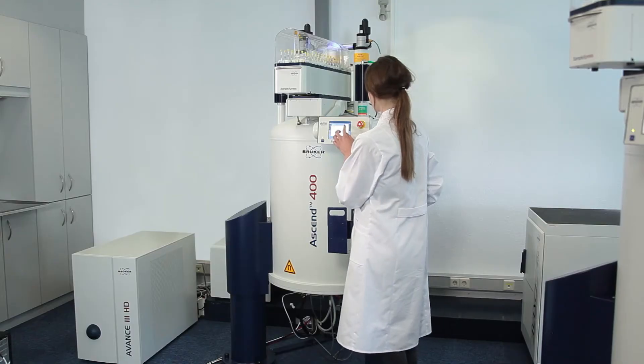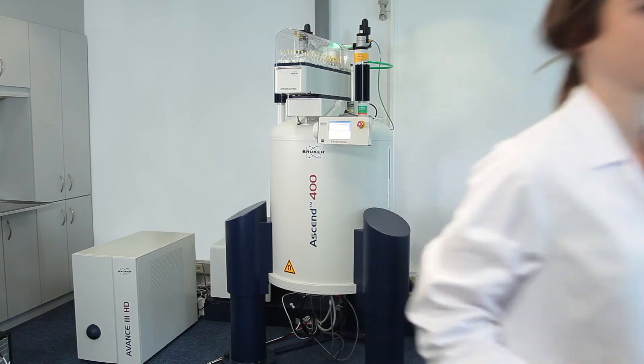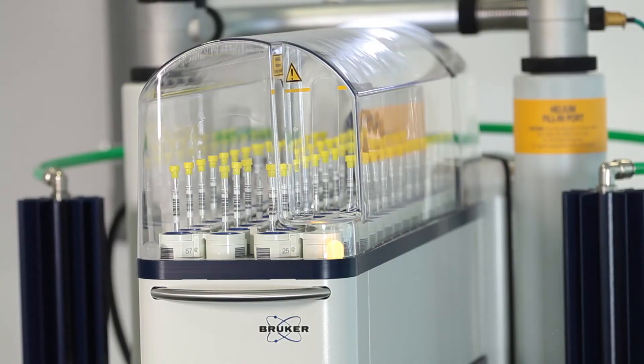From now on, no more manual interaction is needed, independent of the type of sample like wine, juice and honey.